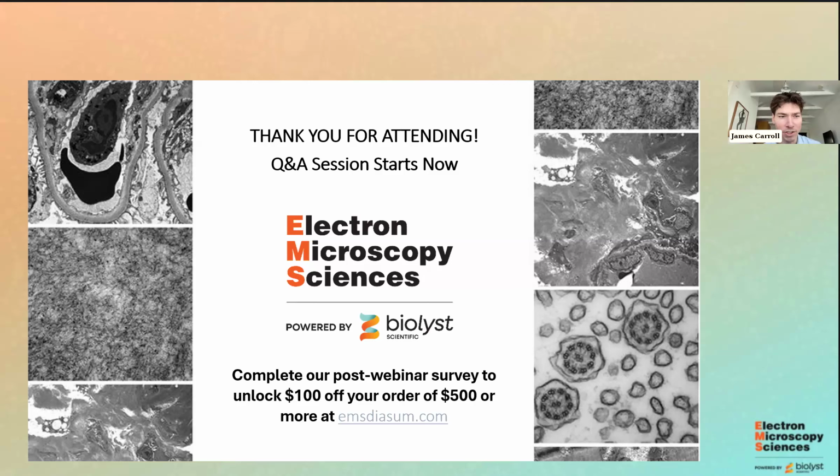Maybe we have one more question that came in. The question is, have you ever needed to combine osmium with potassium ferricyanide to help with contrast? Or is osmium only good enough? We still do on occasion, just depending on the tissue. All our muscle tissue we used to. I just kind of stopped doing it. It didn't really seem to make a huge difference in what I was seeing.